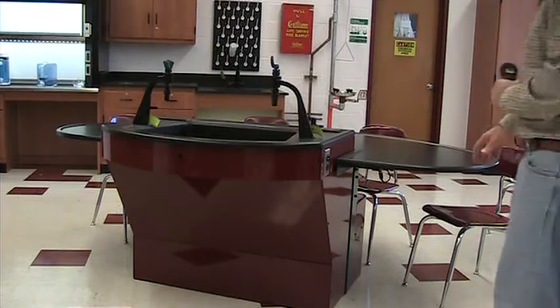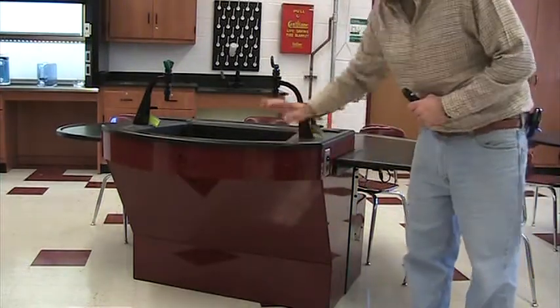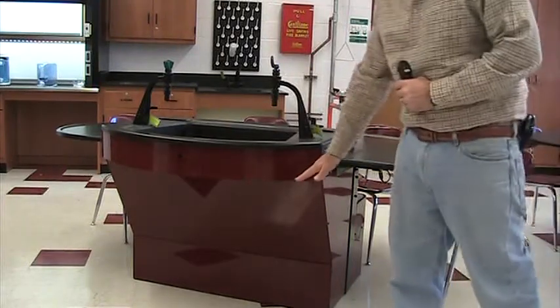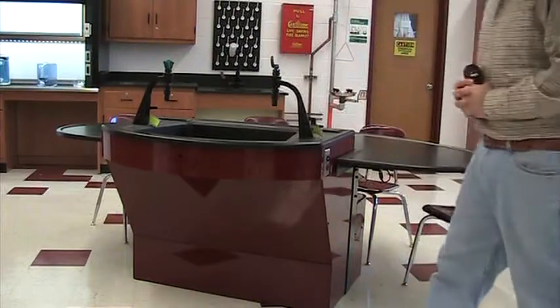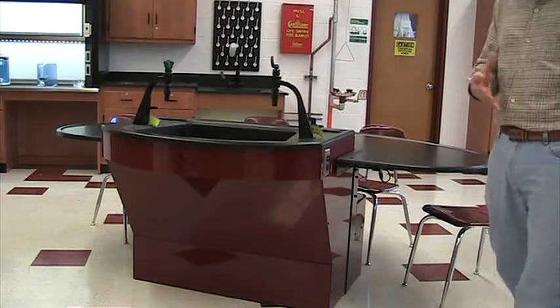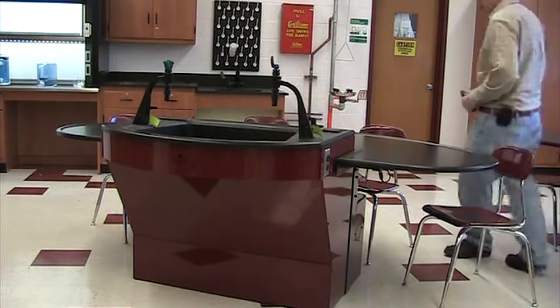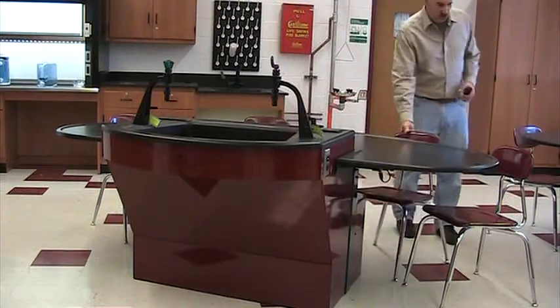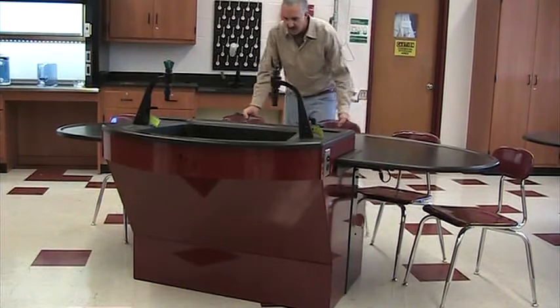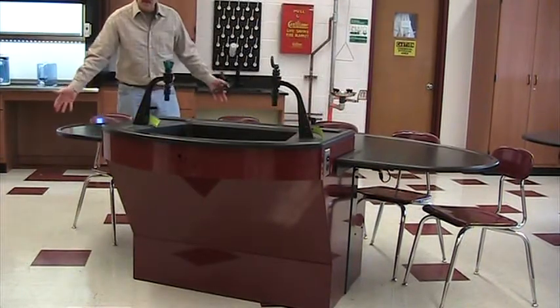What we are looking at here is a totally enclosed understructure with a cantilever sink, meaning ADA accessibility at all of the tables. In this particular case, in many cases we have six in a room to accommodate 24 students, and certainly in overground situations, five to six standard 18-inch chairs fit around the unit.